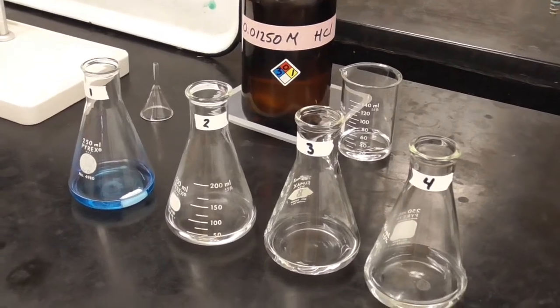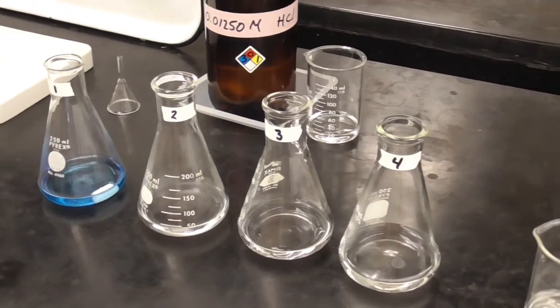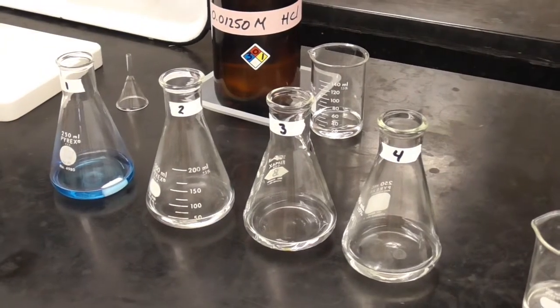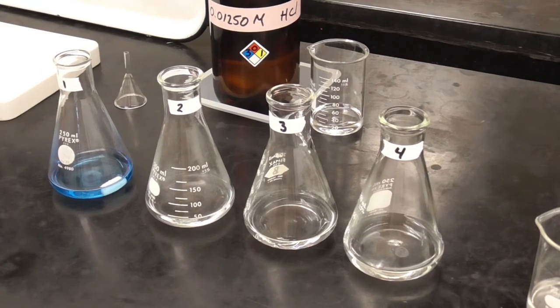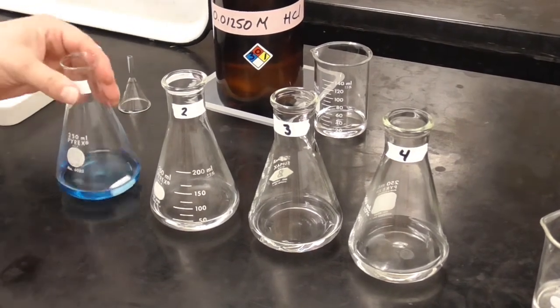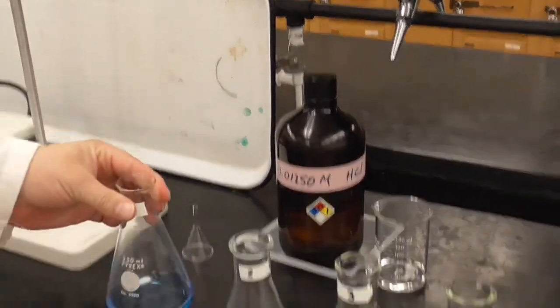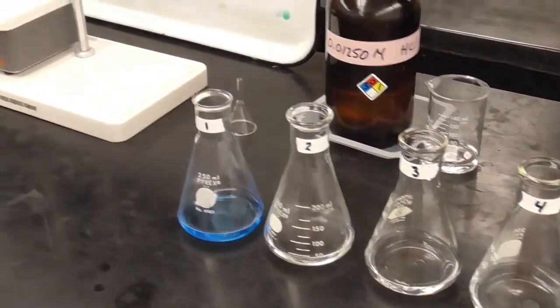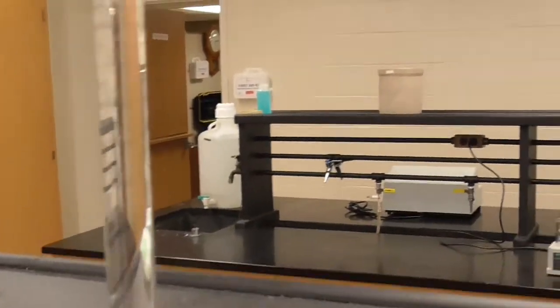Okay, so we waited for it to cool, and then I went ahead and pipetted 10 mils into each of our 4 samples here of the hot temperature saturated solution that we filtered. And then I added 25 mils of water to each one. I added the 5 drops of indicator and my stir bar to that one. And we're about ready to titrate. I refilled my burette.